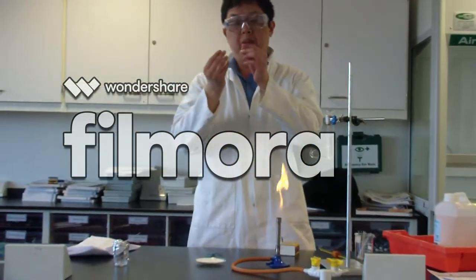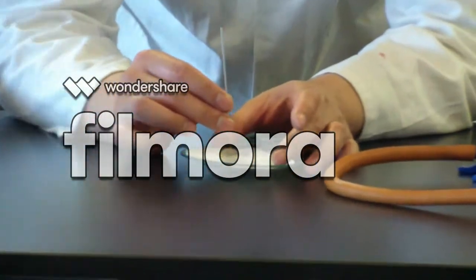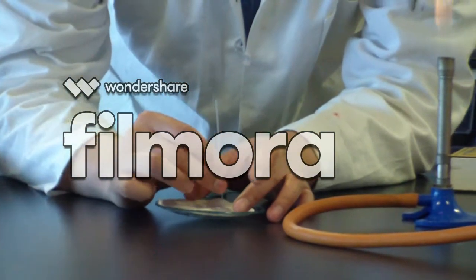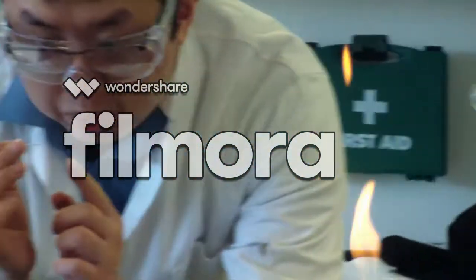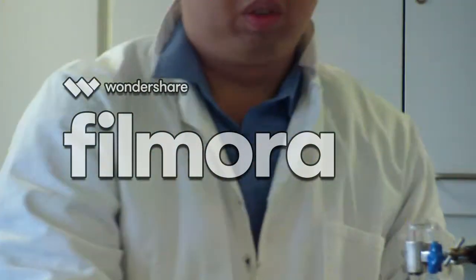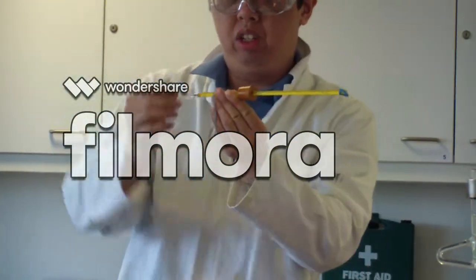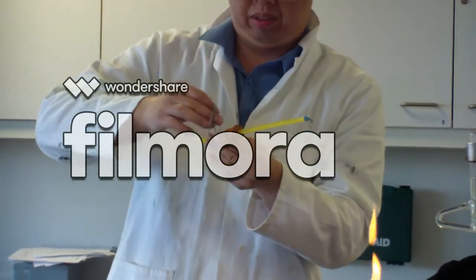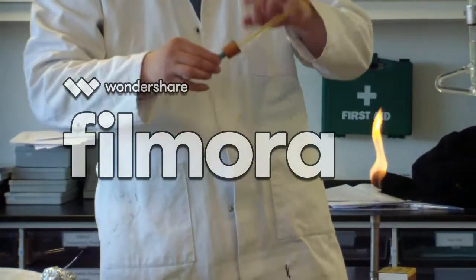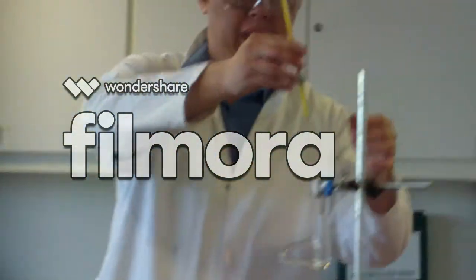We get a closed melting point tube that is sealed at one end, and we slowly pour a little bit at a time into the tube. When you get a little bit in, you turn it upside down and tap it in. When you have enough, you put it level with your thermometer, and then you put an elastic band on it to secure it in place. Now it's secure. You push it up to the top, and then you put it inside the Thiele tube.